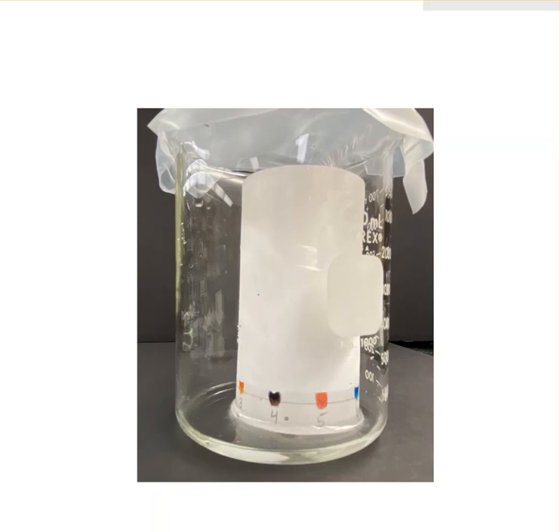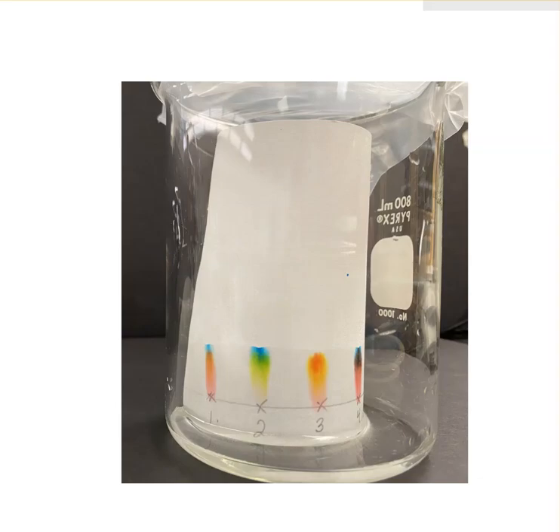But you see that as soon as we put the paper in, the liquid starts going up, soaking up the paper by capillary action. And as it does, you can see that where the dyes were, they're starting to smear upward with that liquid. As time passes, the liquid gets further and further up. It's still moving up, and we start to see some differences in where the dyes are going.